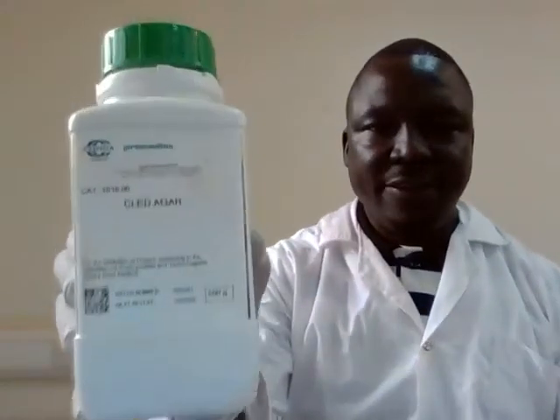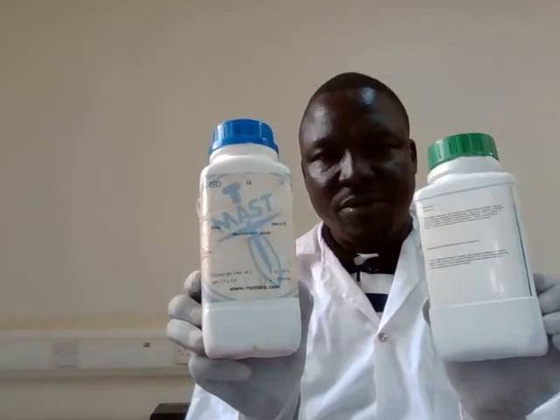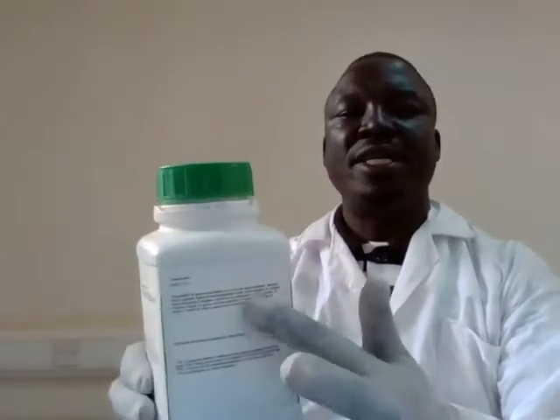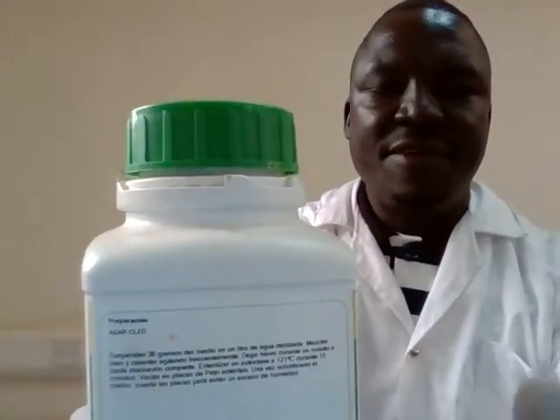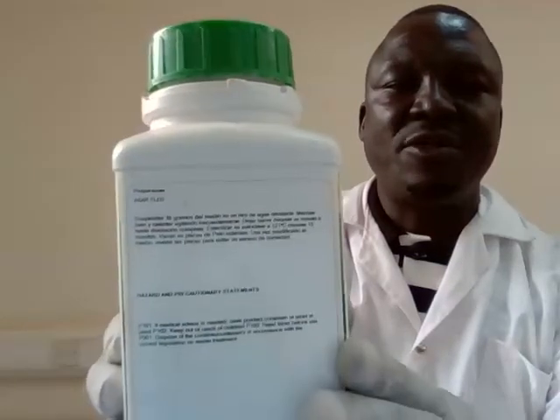This is CLED, and so many others which I have not mentioned. But now, for isolation of microorganisms, this culture media, you need to prepare them following the manufacturer's instruction, which is always specified on every media here.